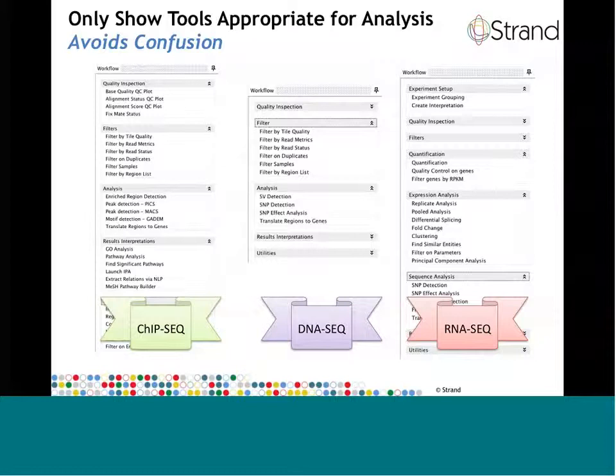So to ensure that the Avadis platform could be used in this wide variety of application areas, we adopted a design principle that will allow the application to morph itself, to adjust its look and feel based on the experiment type that you are analyzing. It will, for instance, only show the tools and icons that are relevant for that particular experiment type, and will not provide any tools or features that are not relevant or appropriate.